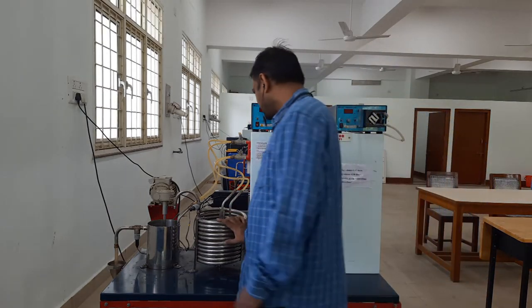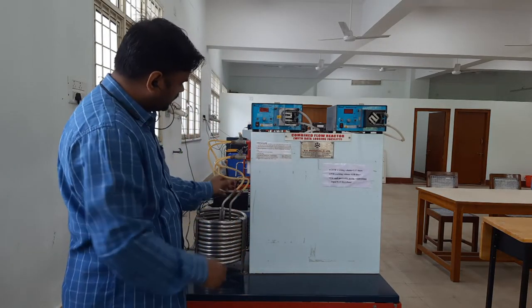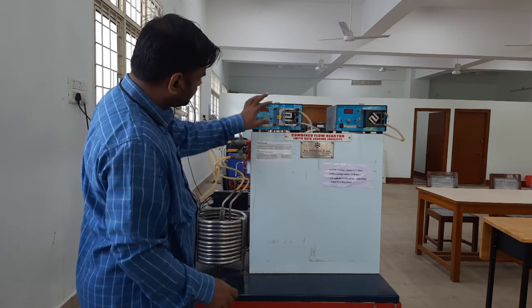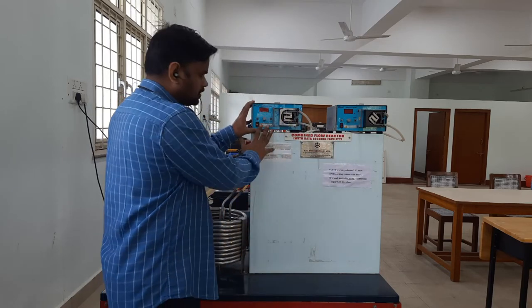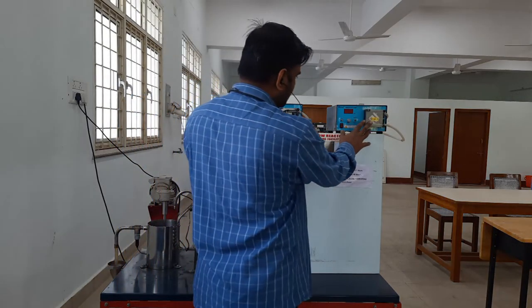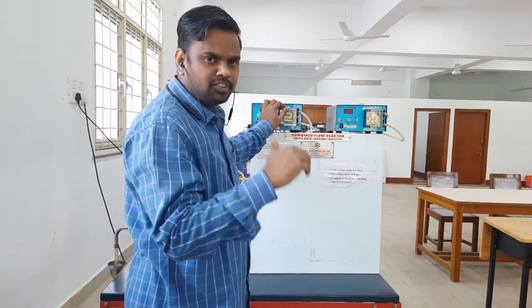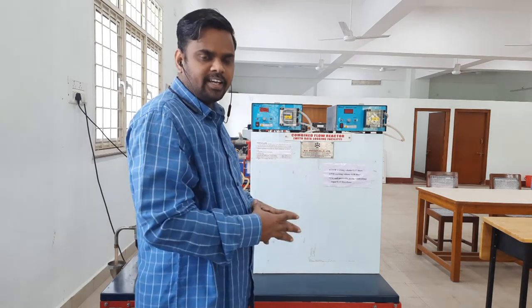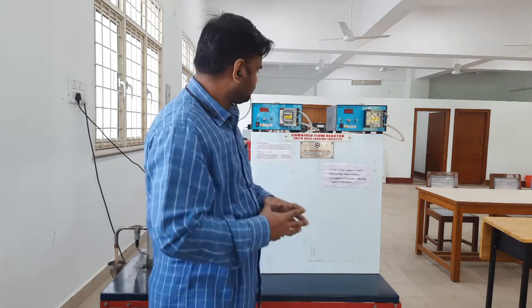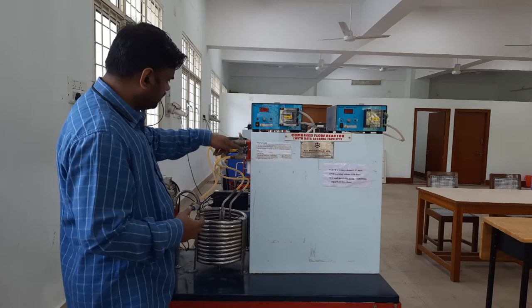What we have essentially is two reactants, so there are two inlets. Two tubes are connected, and the inlet will be provided by two peristaltic pumps, peristaltic pump A connected to feed tank A, and peristaltic pump B connected to feed tank B. It is similar to the setup which we showed in the last lab. In the back side, we have two tanks, feed tank A and feed tank B. Feed tank A is filled with NaOH, and feed tank B is filled with ethyl acetate. Through tubes and the peristaltic pump, the inlet is coming up to here.